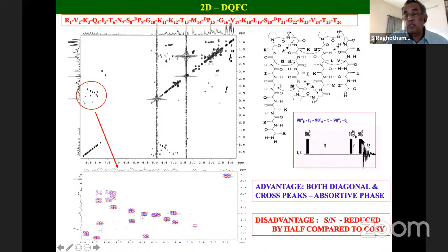Now, the normal COSY would be a 2-pulse sequence, but here is one more pulse with a small microsecond time delay between them. How it works, we have to go to the mathematics and work out the trigonometry. This is simply algebra, one can work it out. In the textbooks, especially Cavanagh et al., they give you every pulse sequence and their product operators and how it works. One can refer to that.